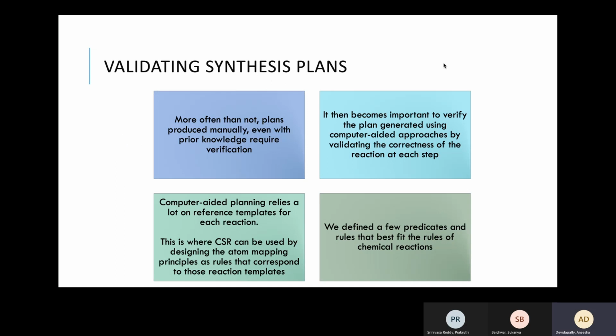What we identified is that more often than not, the synthesis plans produced manually, even with prior knowledge and expertise, of course, require verification. And this implies automatically that computer-aided approaches too require validating the correctness of the reactions that were identified in the retrosynthetic steps. These computer-aided plannings we identified rely a lot on reference templates for each reaction.